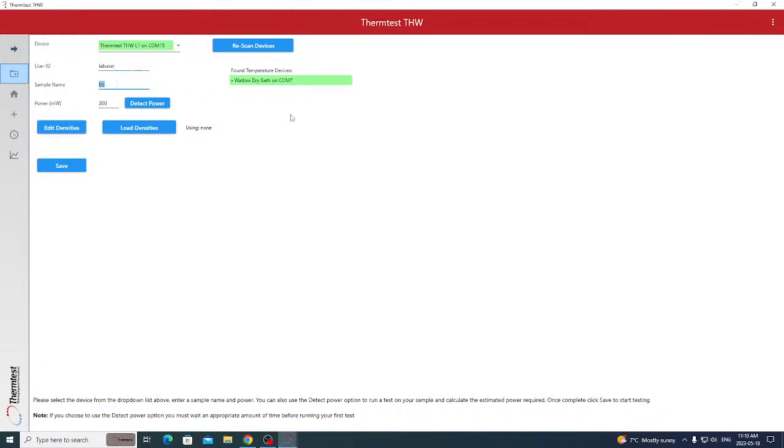As part of our design of transient methods, we've integrated an approach to measurements and a selection of parameters, which we call the I-transient, or intelligent transient. On the L1, whenever we're talking about automation of parameters, I would refer to that as the I-THW, or the intelligent THW. When we're talking about the transient plane source, we would refer to that as the I-TPS, or the intelligent TPS.